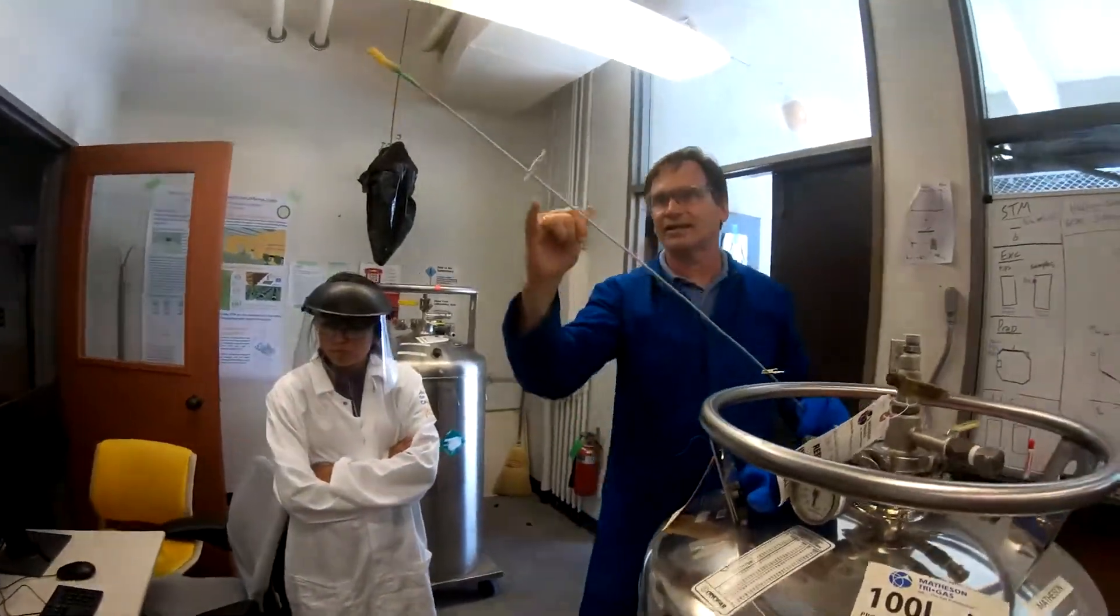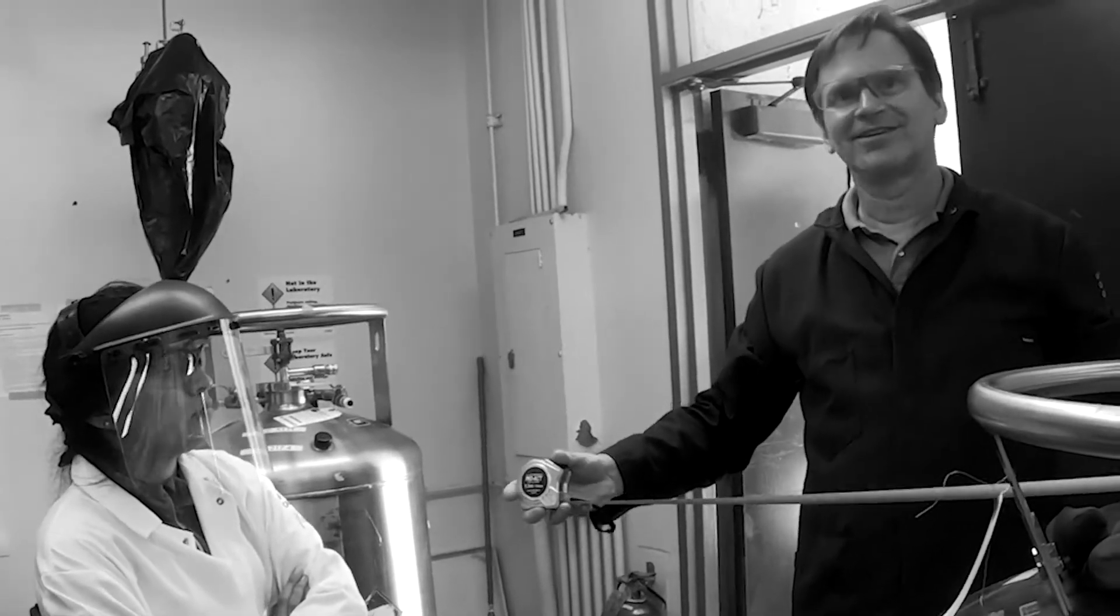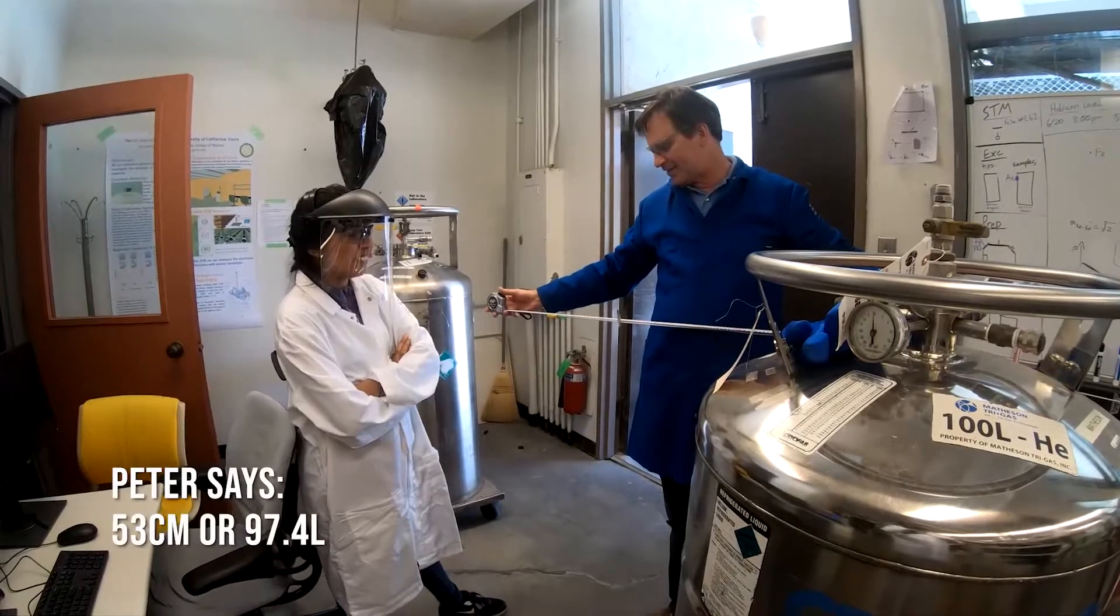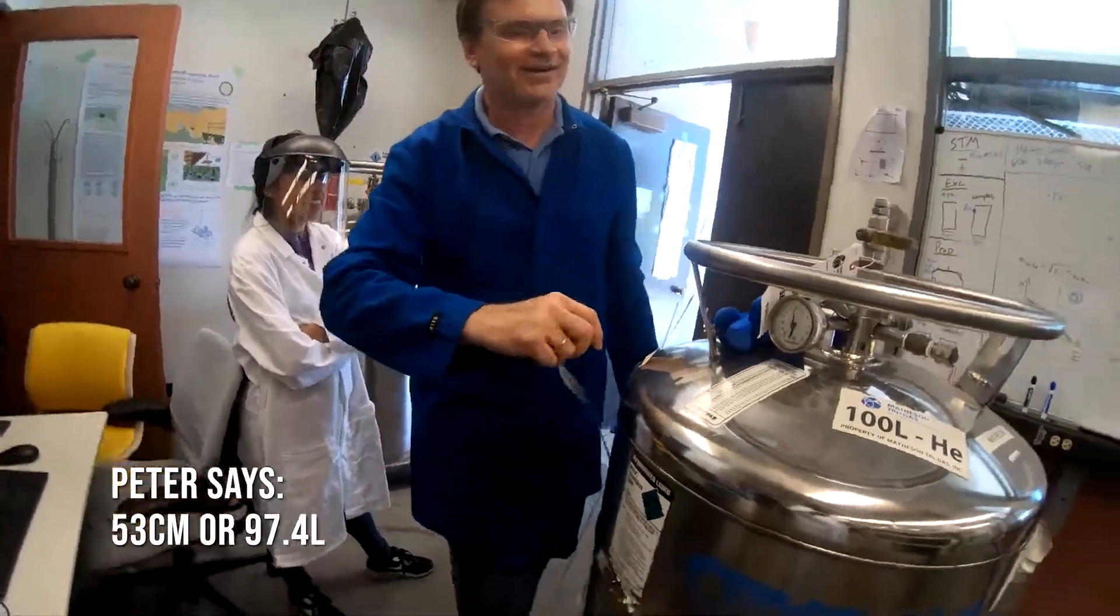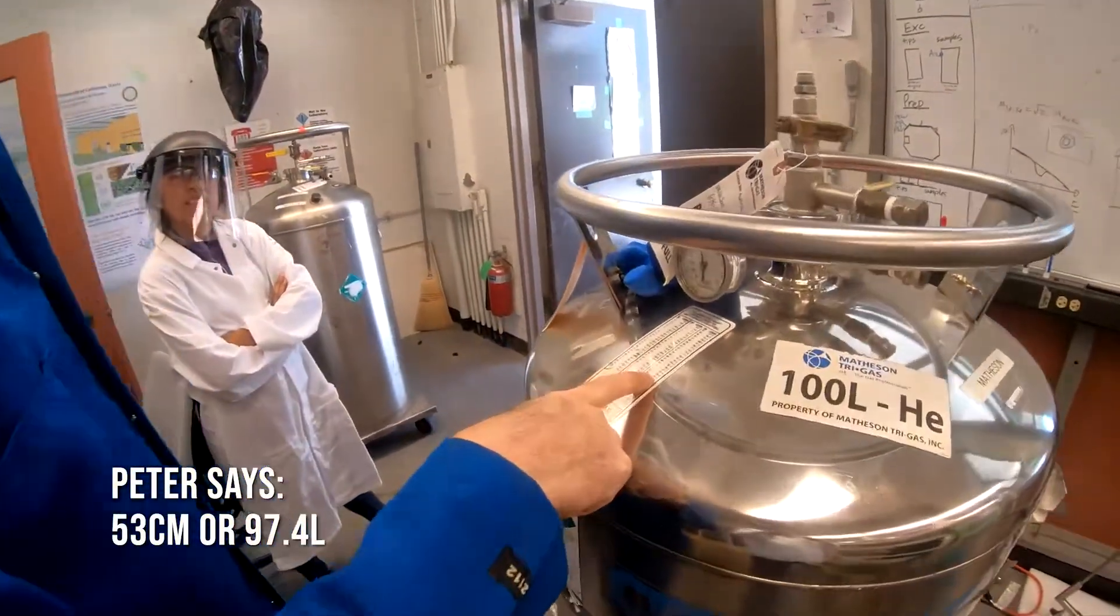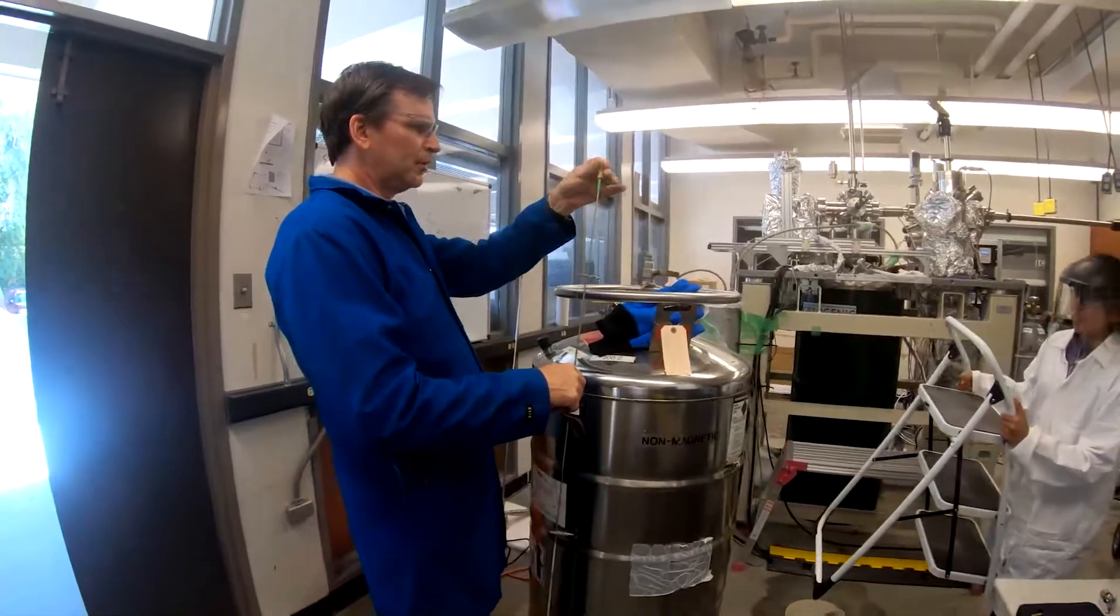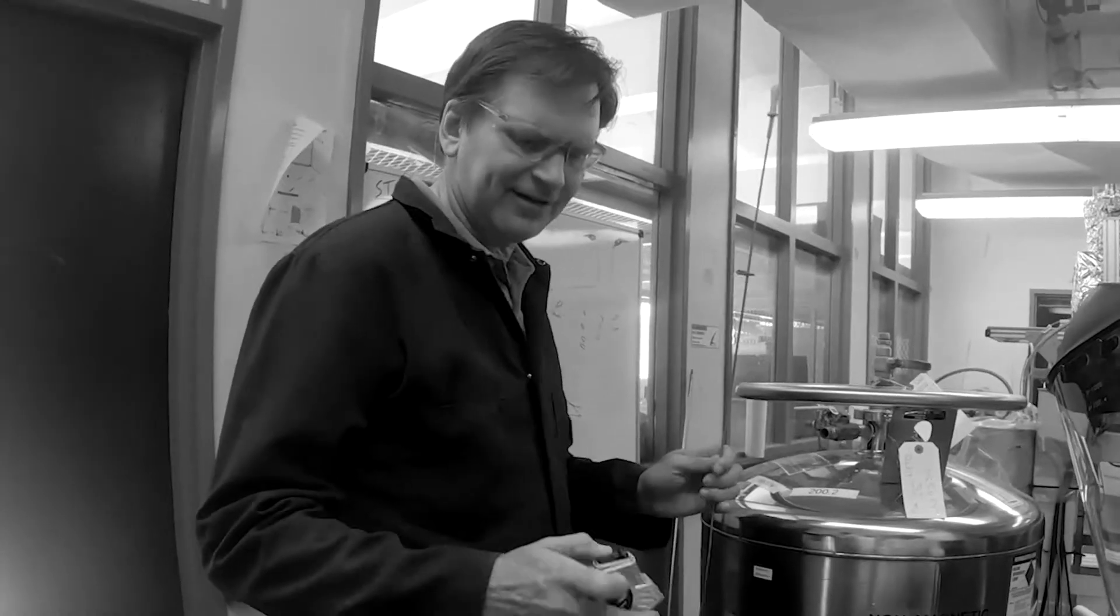We can use a meter stick. We've been doing centimeters. Oh, this is in centimeters. I've never seen one of these. So we have 53 centimeters. So we will look on our chart right here. 53 centimeters is 97.4 liters. So it's nice about these eyedropper bulbs, you can actually even hear them change frequency speed. I love this.